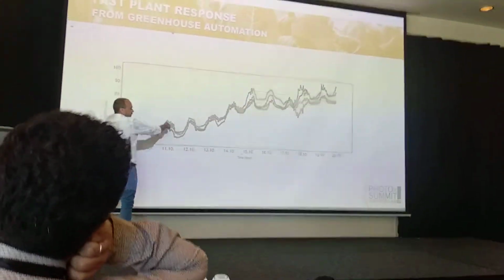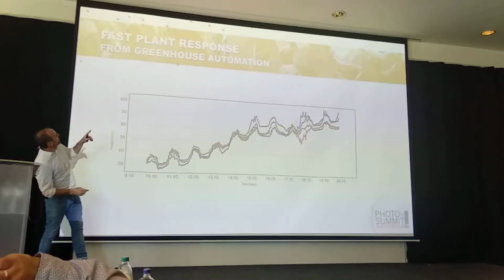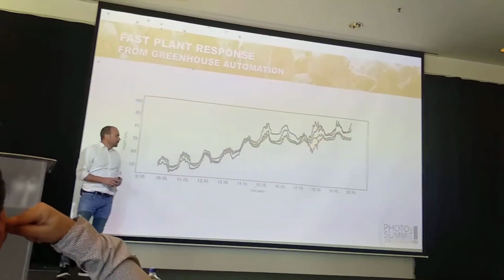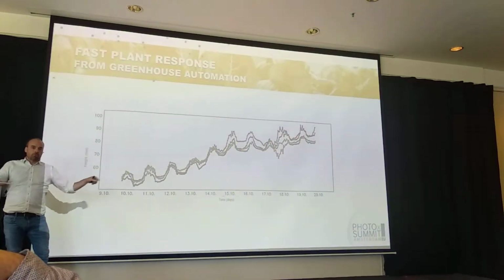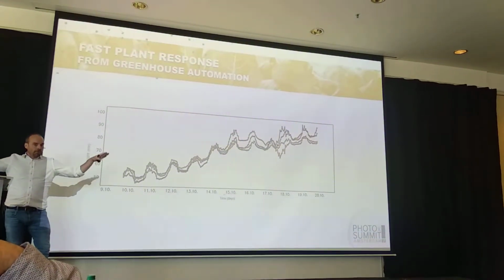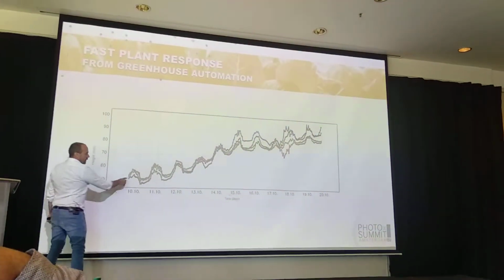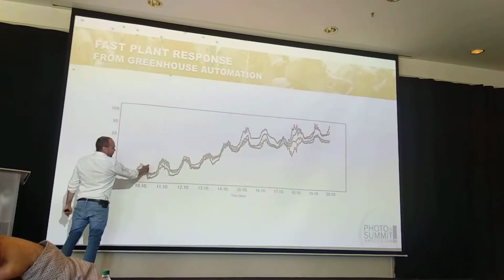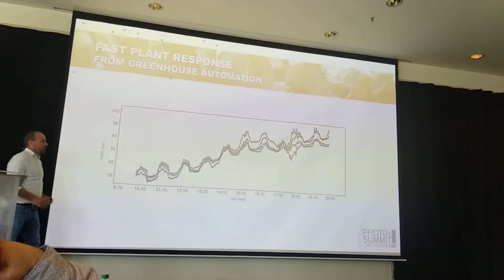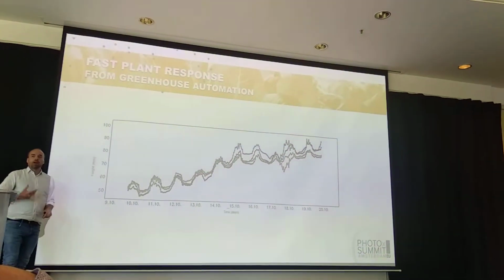And what you see here is an up and down. That's not a measurement error, it is actually the diurnal rhythm of the plant. The leaves are moving all over the day. You could see it a little bit in the videos, the plants are adjusting their leaves. This is also species dependent: here these peak at midnight, but some peak at 3 o'clock. But you always have this up and down, and it is really like a heartbeat.